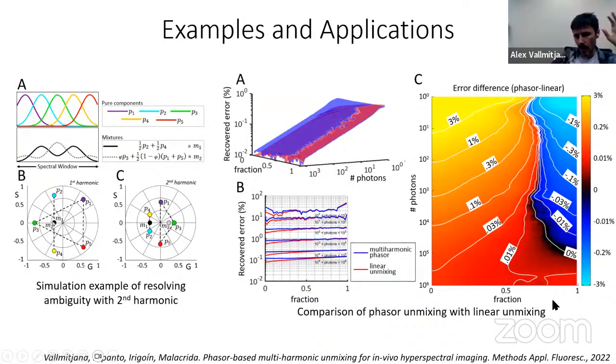So here's a distribution of error as the number of photons increases. If you have enough photons, it is easy and the error is super low. But the conditions in which we usually operate are photons per pixel, so we're talking about a few dozen. We usually operate in this region in fluorescence microscopy, from a few photons to, say, up to 100 per pixel.